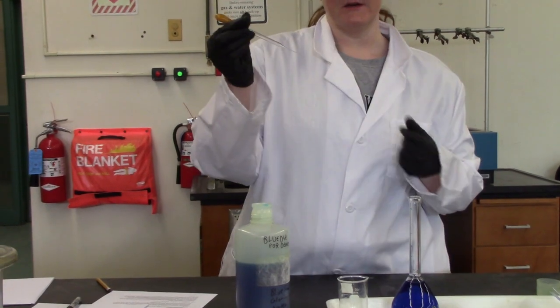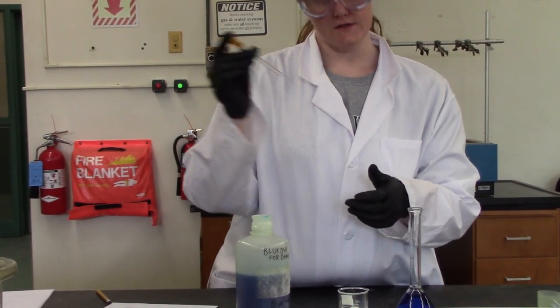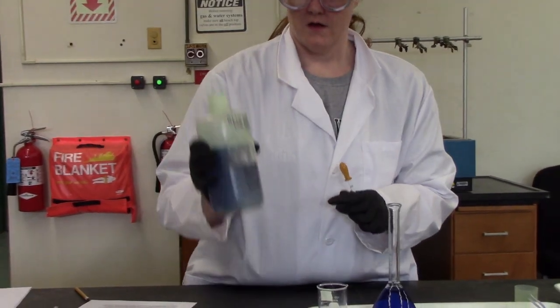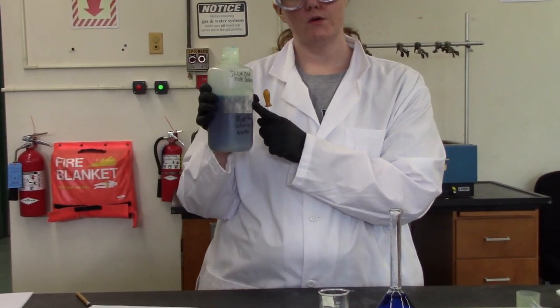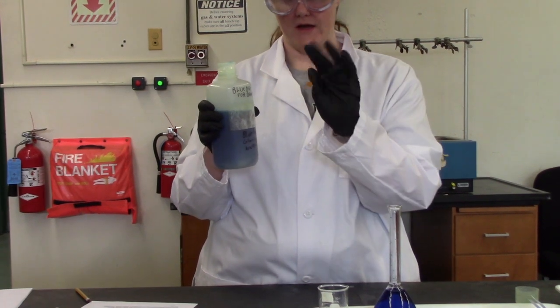And so I choose a Pasteur pipette. You could use a medicine dropper from your drawer. It doesn't really matter. This gets a bit of a bigger volume. This is my stock bottle. We never put anything into the stock bottle, spatulas or pipettes or anything like that.